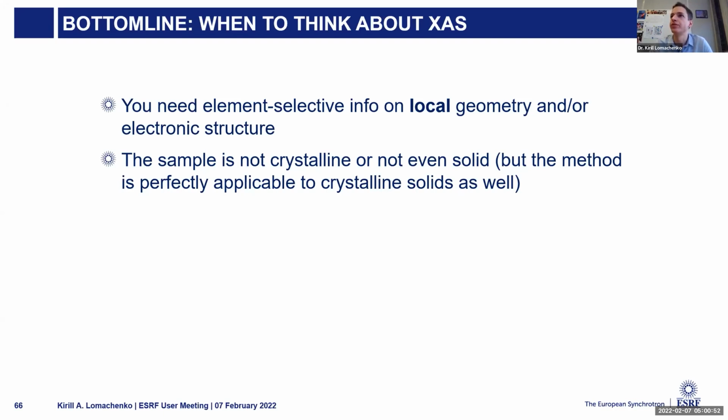So you might be interested in using XAS, but of course XAS is also perfectly applicable to crystalline materials as well. So it's not an issue for XAS, but it can be an issue for other techniques.